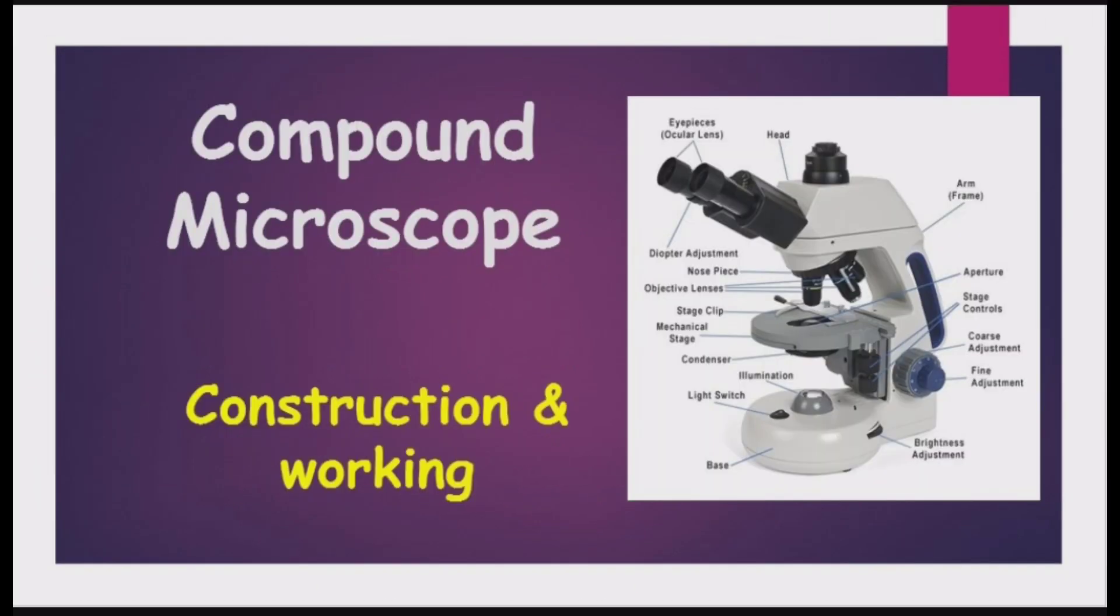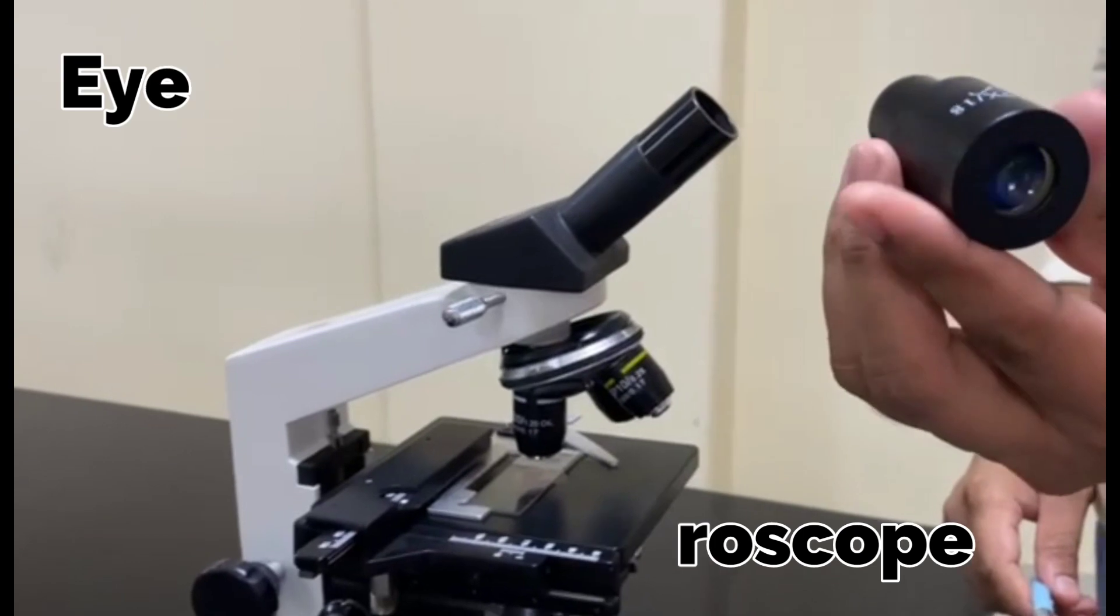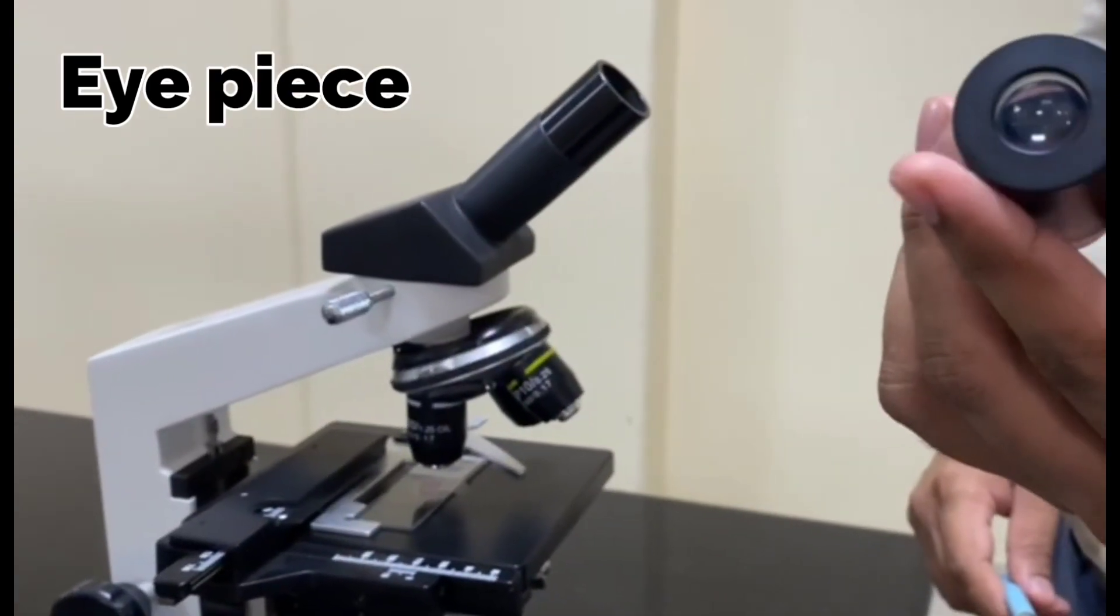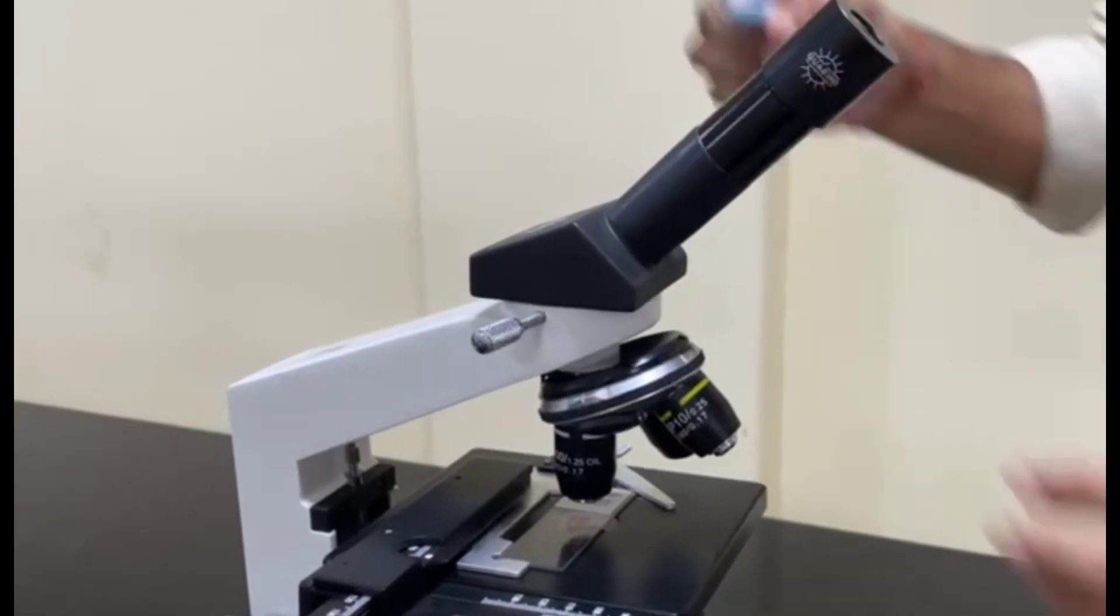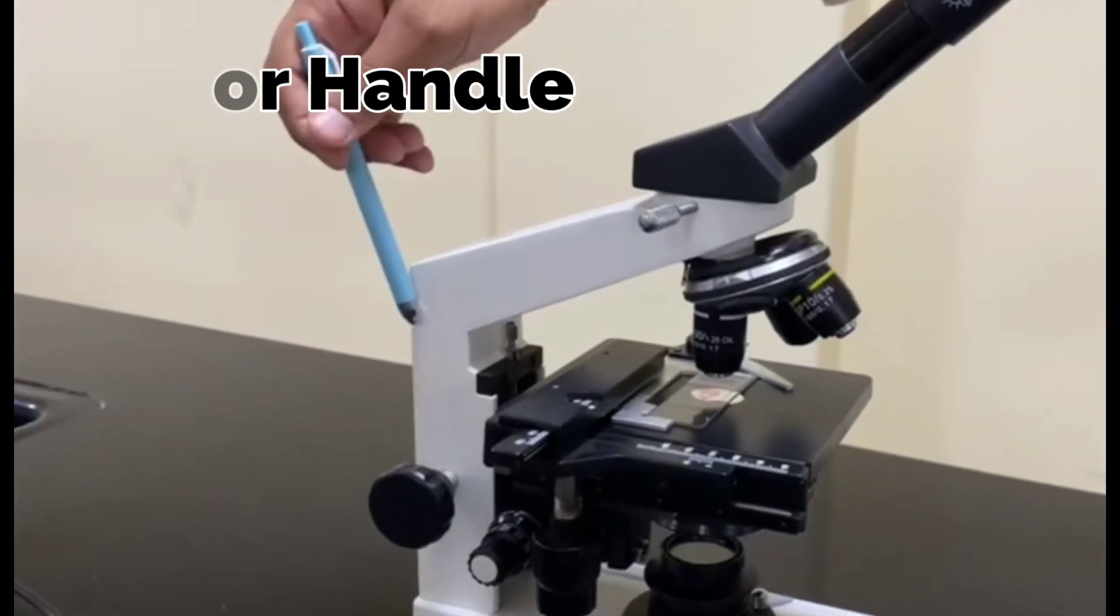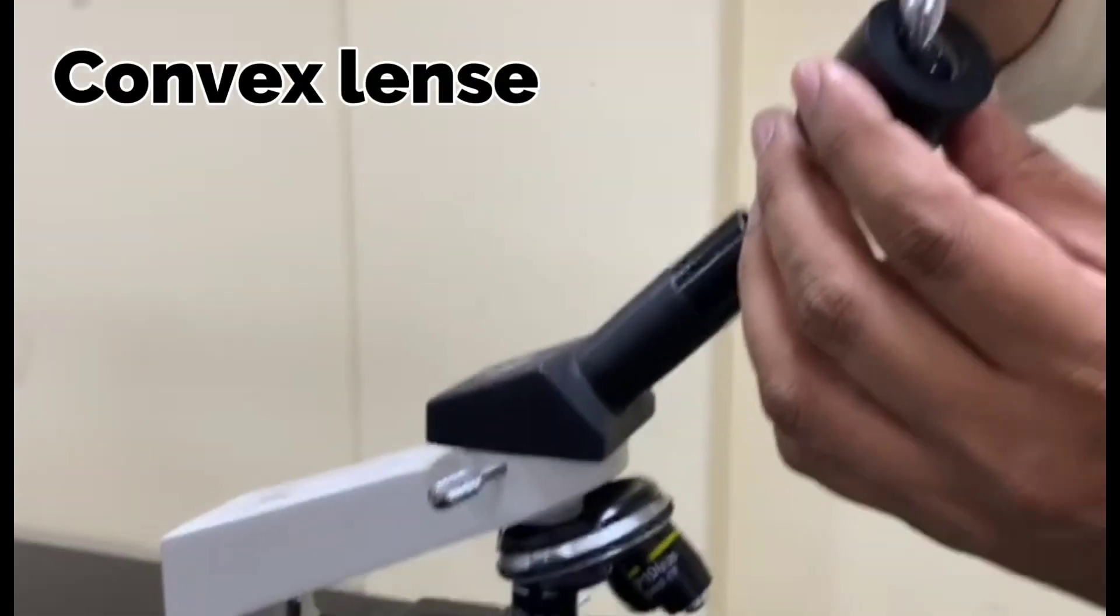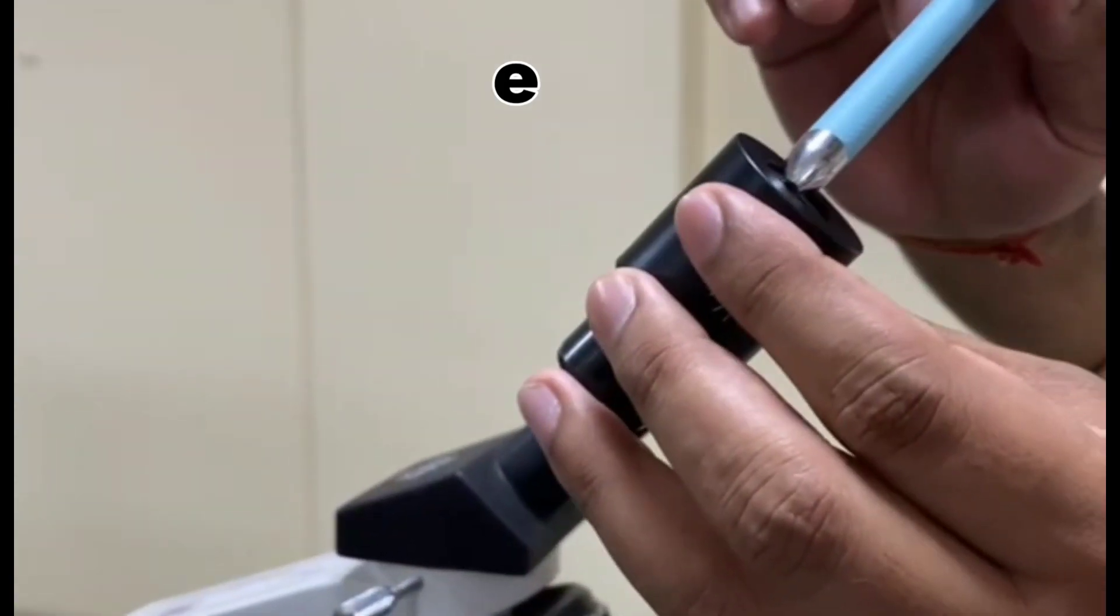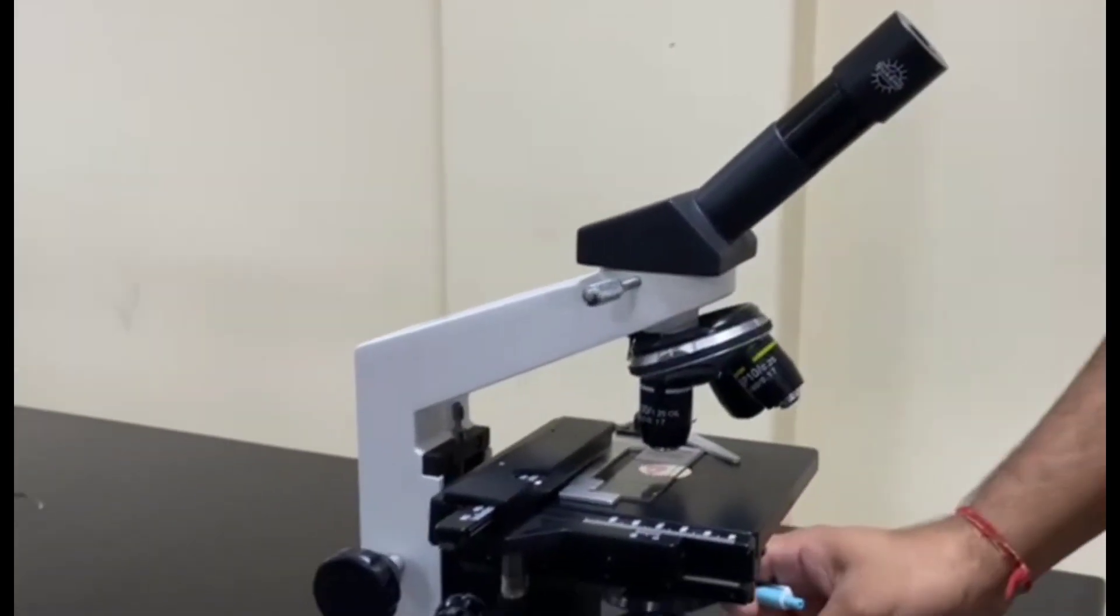Today we'll see about the compound microscope. This is the eyepiece. This fits here as you can see, and this is the arm or handle of the compound microscope. This eyepiece, if we talk about it, you can see this is a bi-convex lens and the power of this lens is 10x.